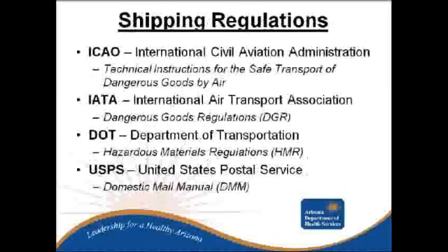There are several regulations that you need to be aware of for shipping samples. The ICAO publishes the technical instructions for the safe transport of dangerous goods by air. The IATA publishes the DGR, the dangerous goods regulations. DOT is for land transportation. They publish the HMR, the hazardous materials regulations, and the Post Office publishes their own manual.